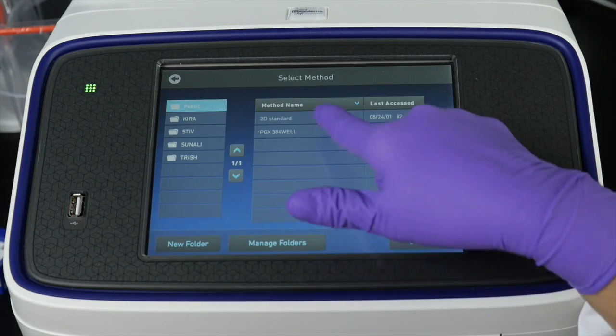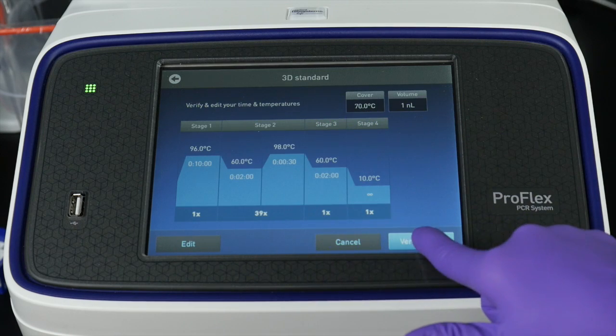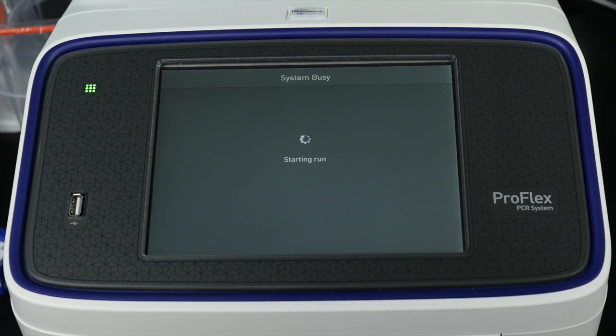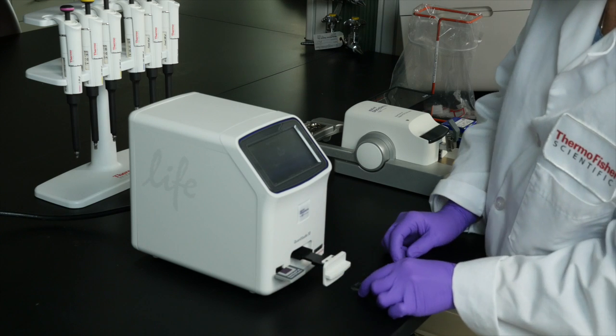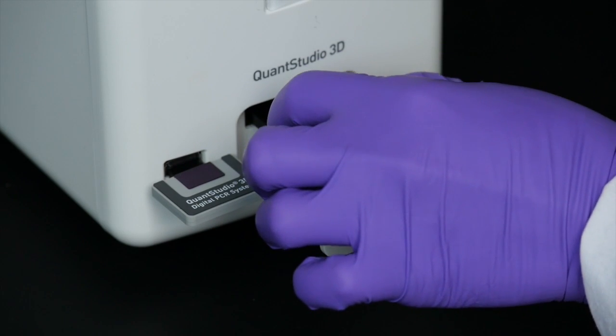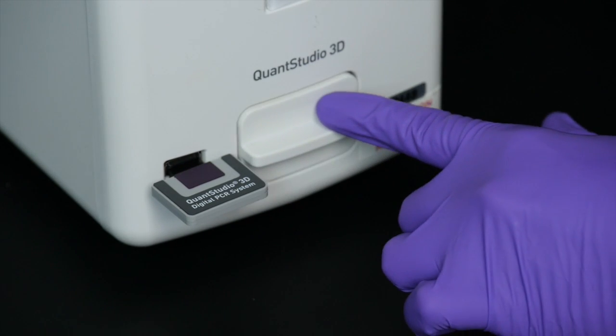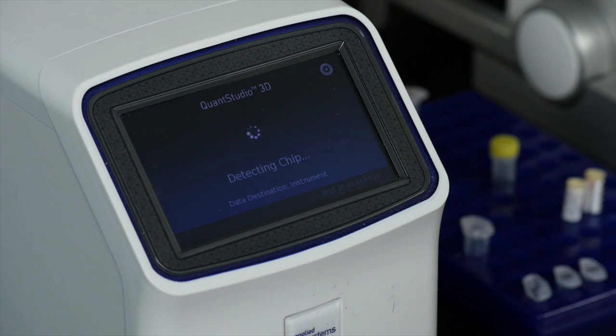Following completion of chip cycling, chips can be held at 10 degrees Celsius for up to 24 hours. One at a time, read each chip on the QuantStudio 3D digital PCR instrument. A read takes approximately 30 seconds to complete.